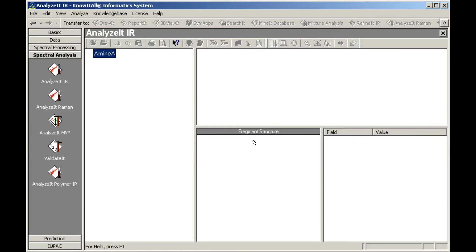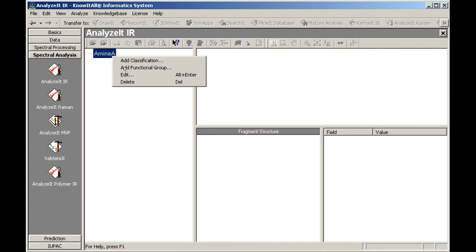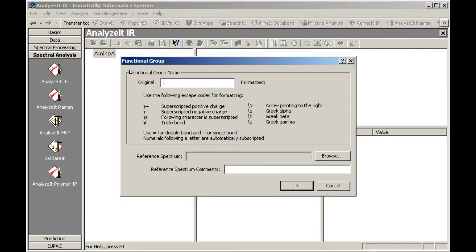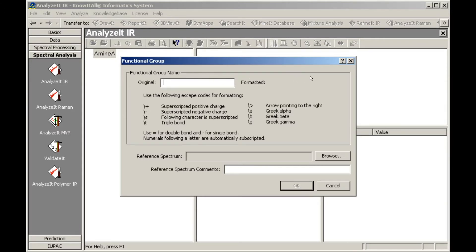Next, right-click the name of the classification in the functional group tree, then choose Add Functional Group. The Functional Group dialog box opens. Use it to type in the functional group name, browse to and specify the reference spectrum, and add optional notes about the reference spectrum.